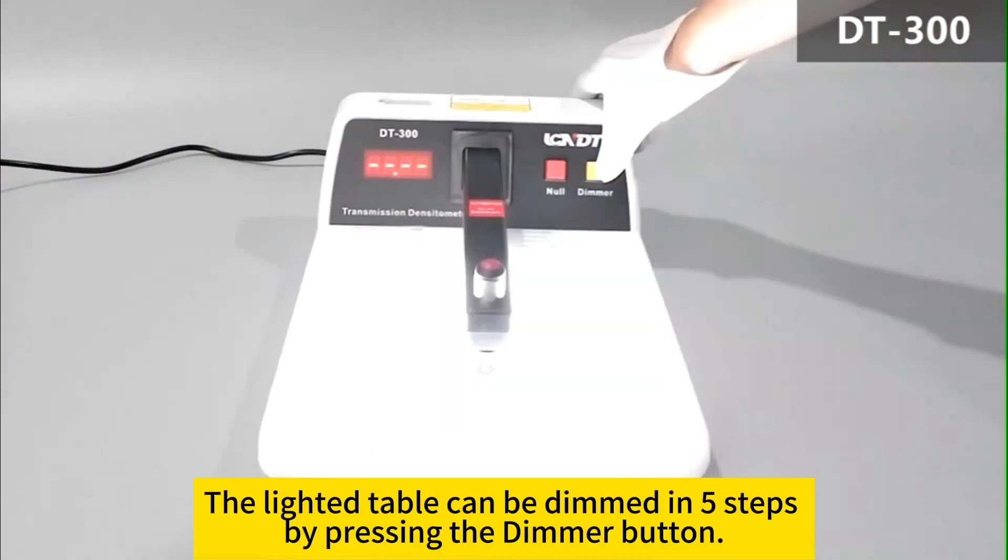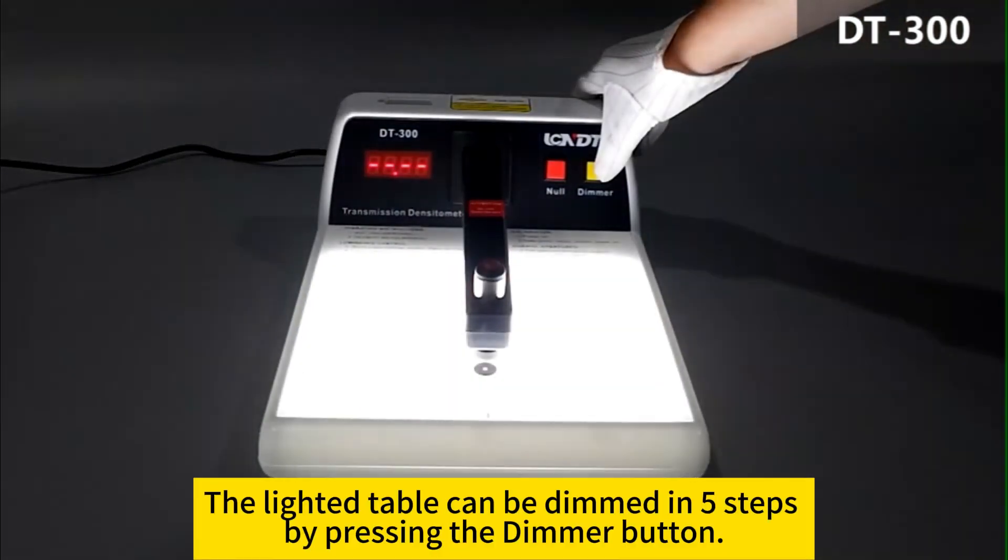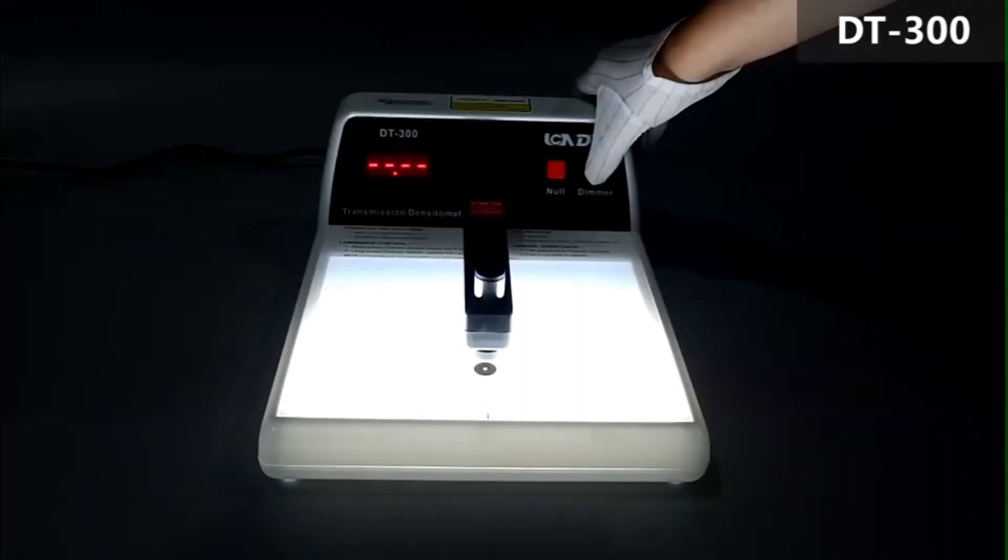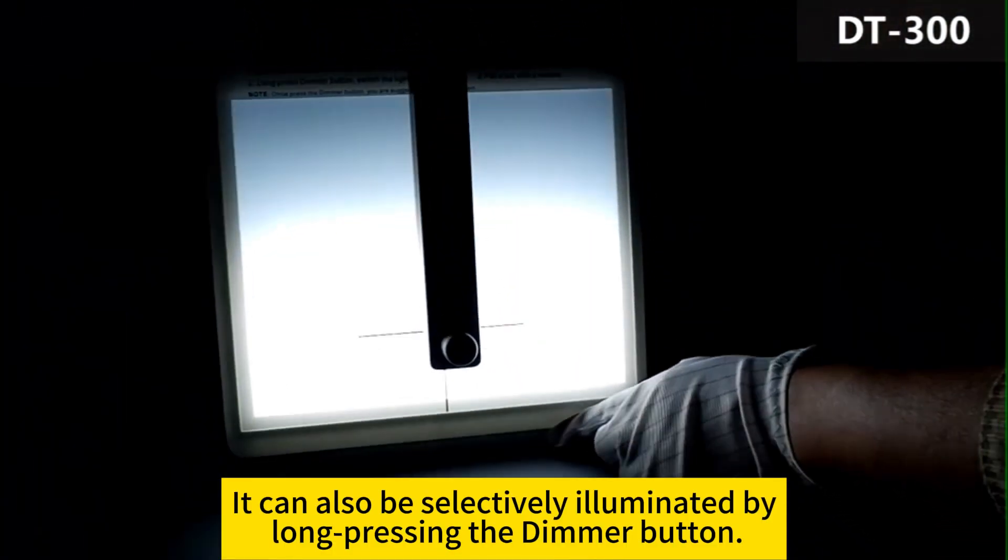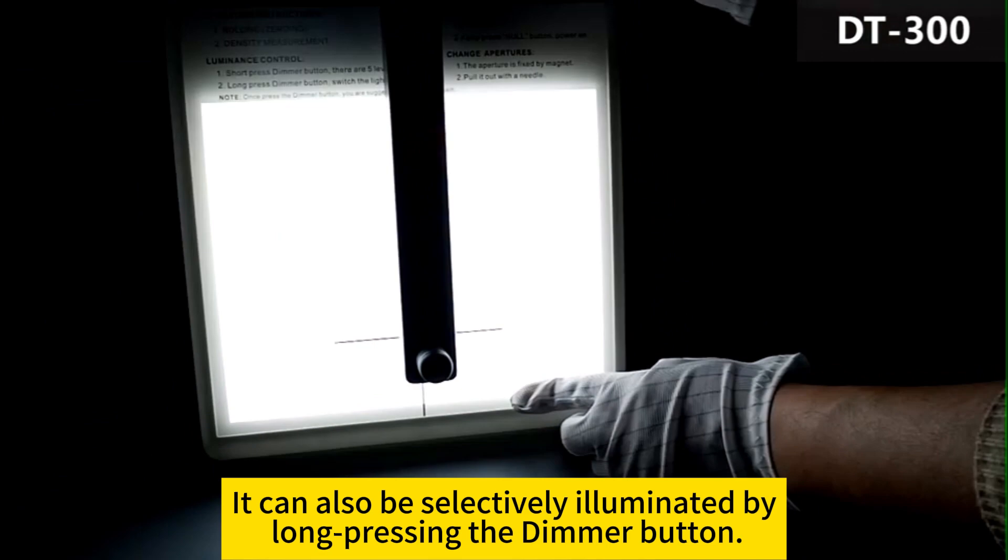The lighted table can be dimmed in five steps by pressing the dimmer button. It can also be selectively illuminated by long pressing the dimmer button.